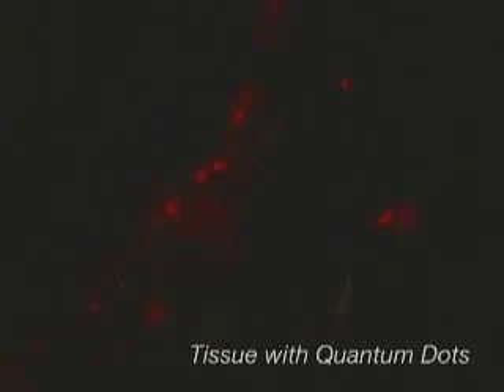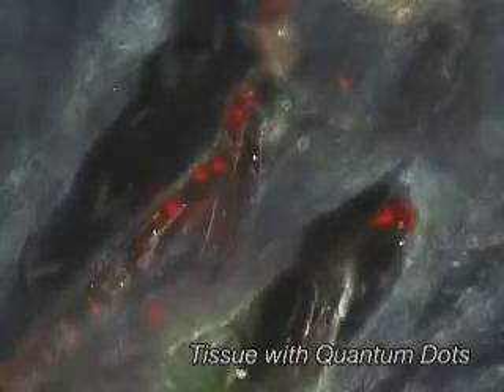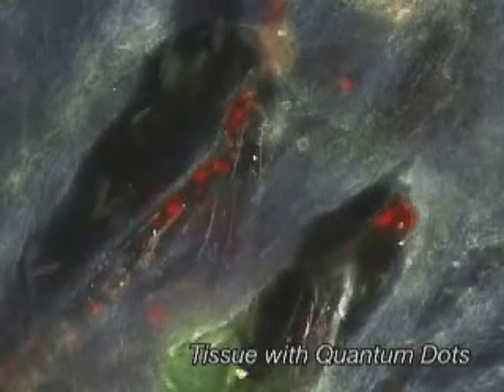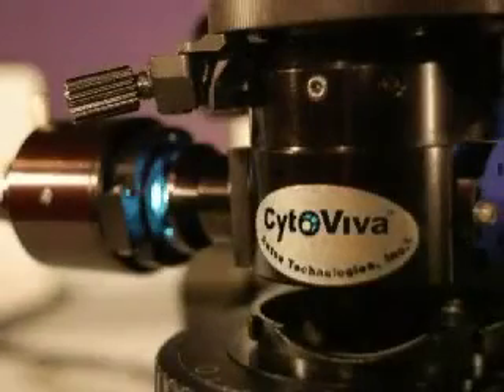CytoViva's ability to simultaneously image fluorescent and non-fluorescent sample structure eliminates the need for complicated software or electronics to create overlay images. CytoViva's high contrast, high resolution capability allows you to observe live cell structure at a level of detail not obtainable with traditional imaging techniques.